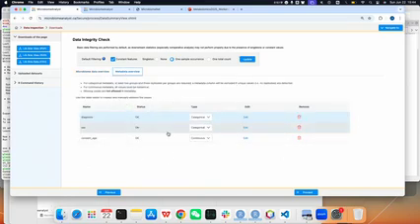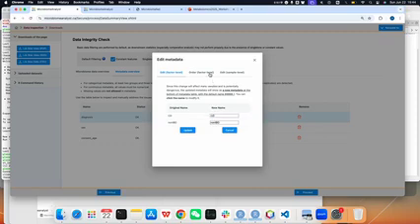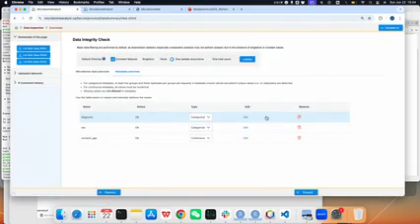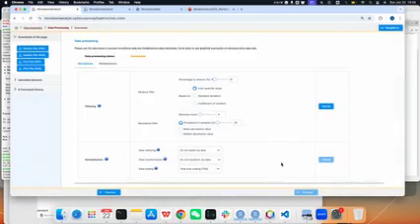It also stays the same. You can always edit the metadata. I forgot to mention that if you want to change the factor order, or change a group label if you find any error, or remove any metadata that is not necessary, you can always do it here. So here we have everything all right, and we can just proceed.